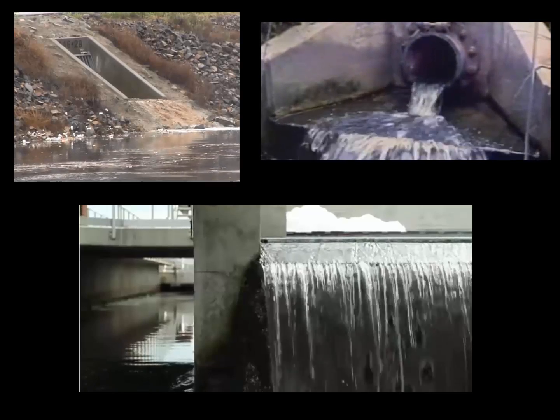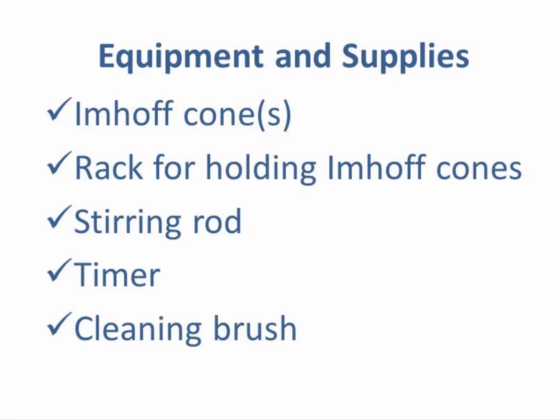The equipment that you will need consists of an Imhoff cone or multiple cones, a rack for holding the Imhoff cones, a stirring rod, timer, and a cleaning brush.